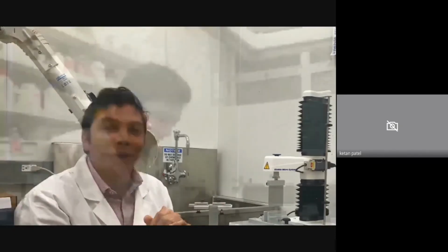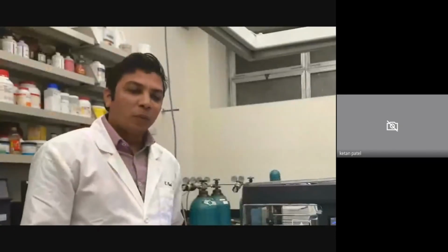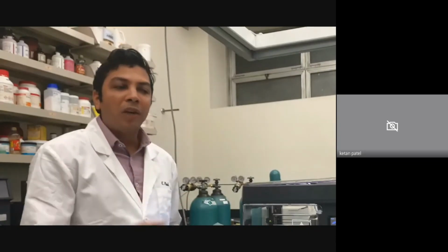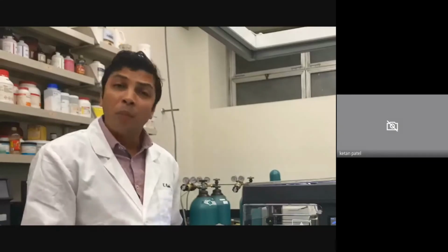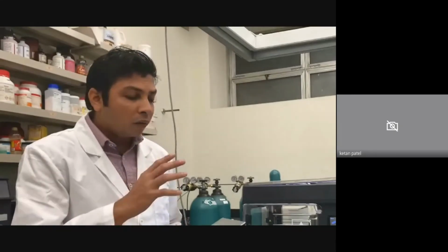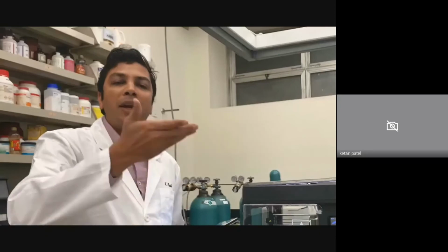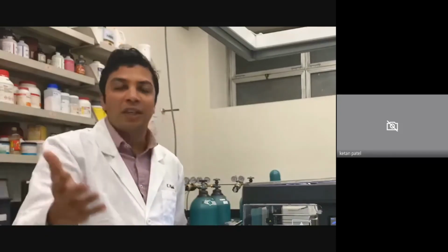Let's do that here, okay? Yes. So the third part of this video and the most important part, FDM 3D printing. Before we do FDM 3D printing, when we have filaments of different drug loading and you see the filaments are appropriate for printing, we design a tablet. Compared to conventional 2D printing, where we print a page and everything, 3D printing is nothing but layer by layer 2D printing, you can say in simple language.